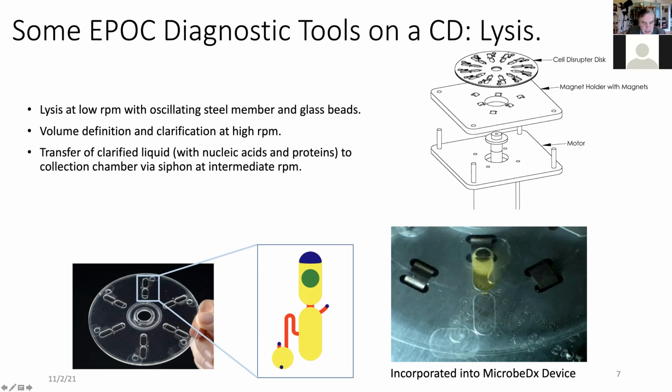Please follow with me before we show this little movie here. I have my plastic disc, and embedded in the disc, these cavities here are closed, right? There's a plastic disc on top and bottom, and the design is retaken here in this drawing. It shows chamber 1, chamber 2, and this is a metal disc that's locked into this top chamber. You can see the metal disc also here. So this is all the same chamber, this top one.